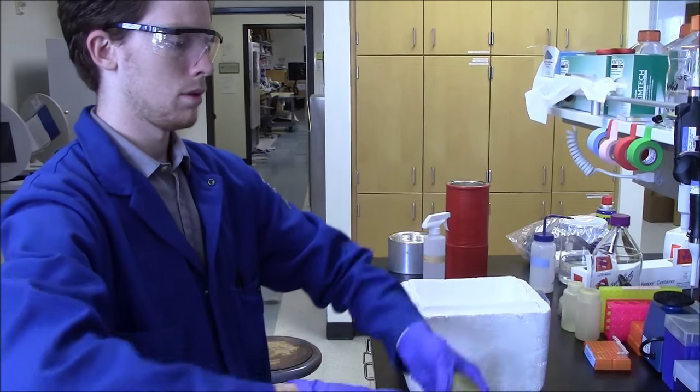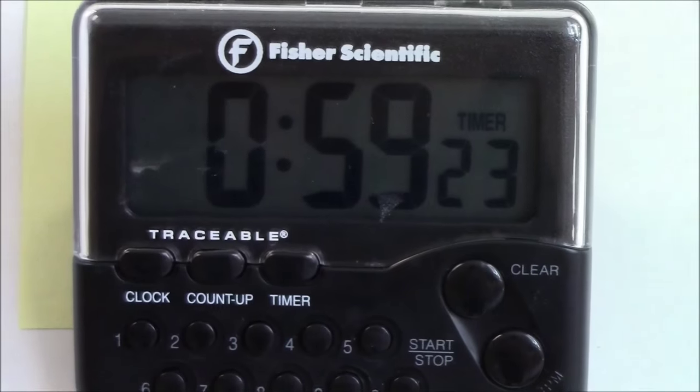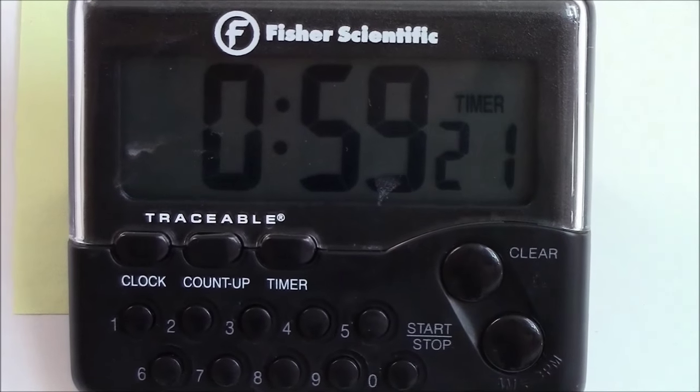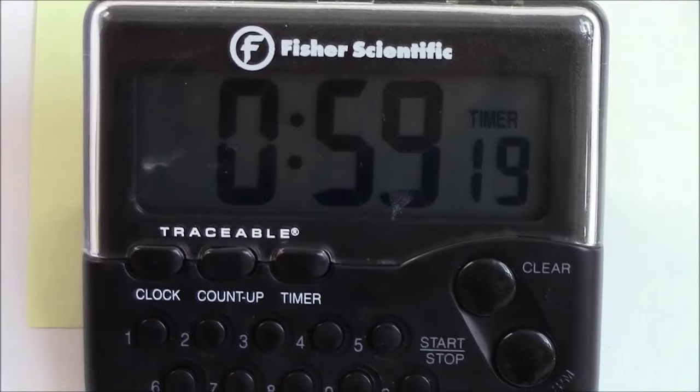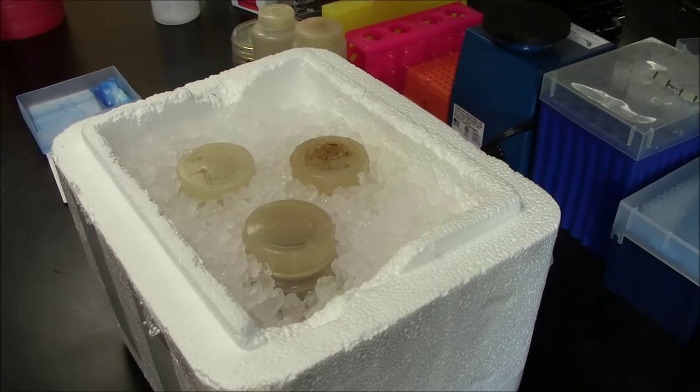And then they'll go back onto the ice for 1 hour. 1 hour incubation. There's the timer counting down. All right, there they are, completely covered with ice. Good.